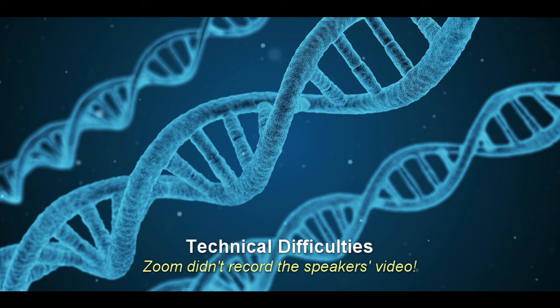really goes back to the why are we doing this? What is it that we are developing? And my sense of it is that right now we're building out the database in GenBank, for example, so that when people plug in the information that they get from this sequencing, they will get matches to it, and they'll get well-identified matches.